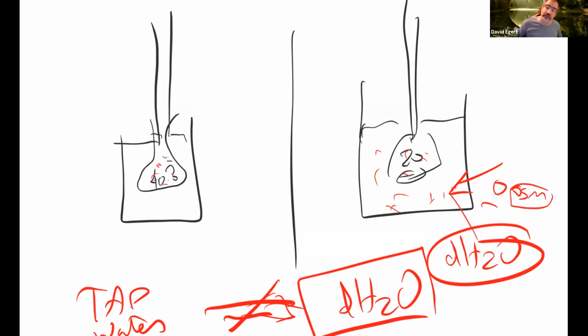Other sources of variability. Barometric pressure. Yeah, barometric pressure, although that's going to be kind of equal on either side. So we need to make sure that nobody is blowing in here on the top or something. Permeability of the membrane, porosity of the membrane. Yeah, so making sure that we're using the same kind of membrane and trying as much as possible to stretch it out the same way. Making sure there are no tears in there that make it easy for stuff to cross. There are all sorts of little things like that.